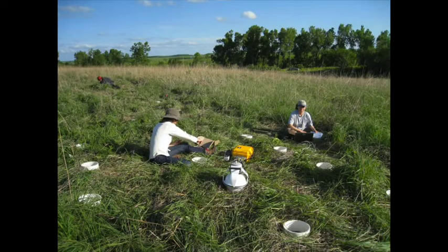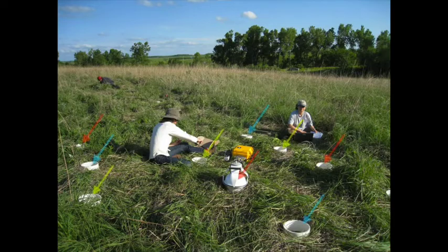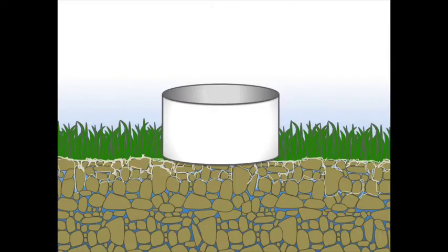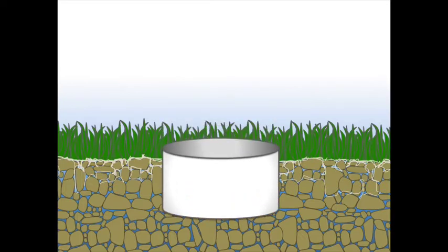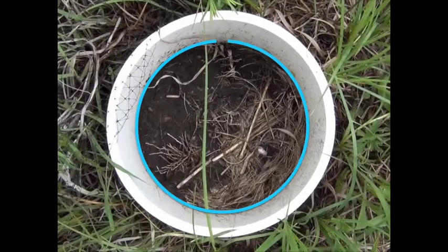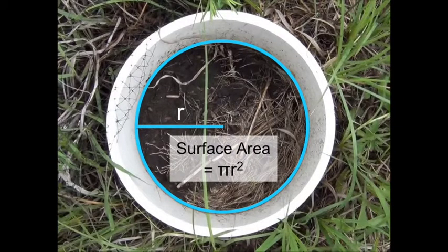In order to make a measurement, we need a confined soil surface, which is provided by these plastic collars. Each collar is pounded into the soil so that it extends a few centimeters below the surface. This minimizes diffusion of CO2 from surrounding soil and gives us a known surface area of soil so that we can calculate a CO2 efflux on a per-area basis.